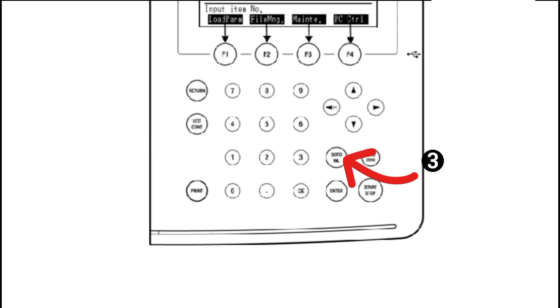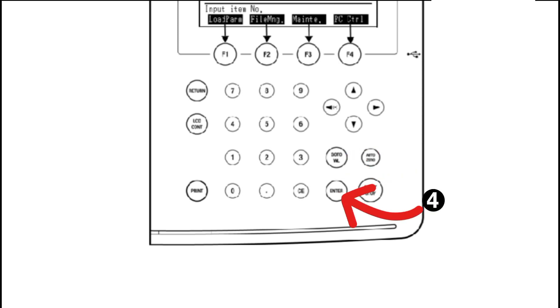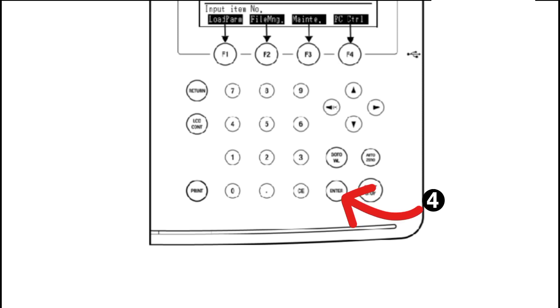Number three, go to WL. Go to WL is basically go to wavelength key, used to change the current or a particular specific wavelength value. Number four is the enter key. When you enter a value, for example wavelength, press the enter key for setting the entered value.